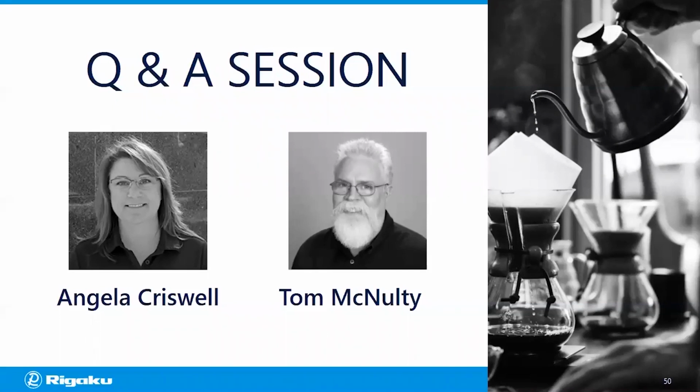Jerome has another question. He's asking if there's a fix, I guess software-wise, if you cannot avoid movement in the plant samples. Are there workarounds for that? Well, I think you're always going to be challenged. The problem is that as the sample moves, you'll start to see some streaking behavior. And then you really have to ask yourself, is what I see a true characteristic of the plant, or is it just a factor of the moving? And at some point in time, you may have to fix it into some solid material.